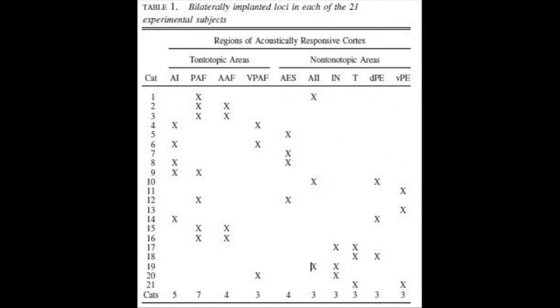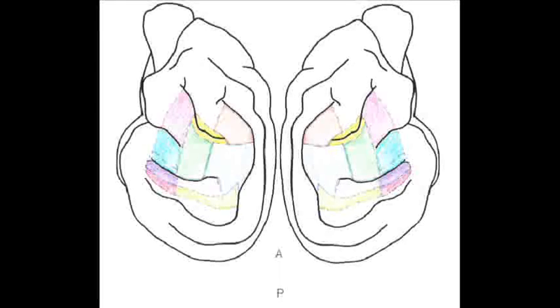After the cats had reached at least 80% accuracy in identifying the location of the sound stimulus, each was implanted with 1 or 2 bilateral pairs of cryoloops over different sections so that at least 3 cats had a cryoloop for each of the 10 sections of interest. After cryoloop implantation, experiments began. Cats performed orienting responses while baseline data was gathered when the cryoloops were off.